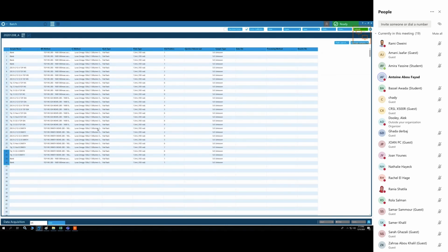I used to be a Maxis 4G Bruker user, and we used to have to run several blanks before running our samples, not just keep the LC at, say, 0.3 ml per minute for half an hour or 1 hour before you start running your samples. Would we have to do the same in this case or not?